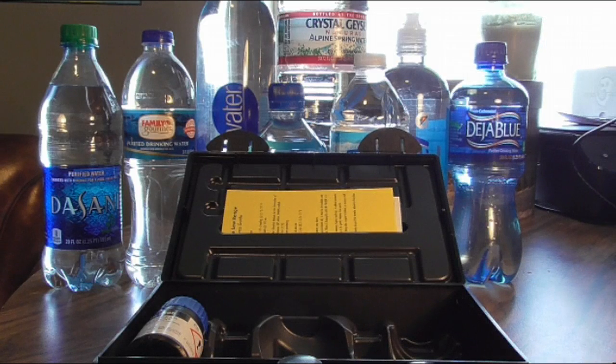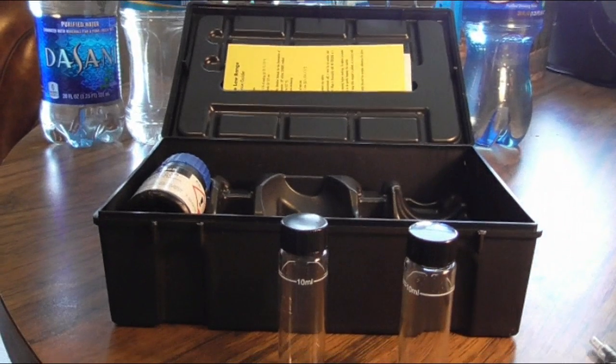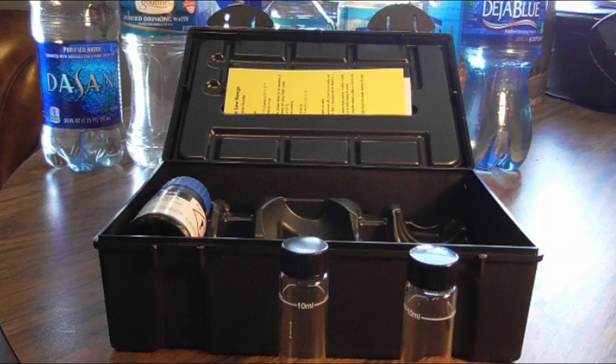The steps are the same thing: you put your first vial in, it does a countdown for two minutes reading it, then you pop in the next one and it gives you what should be around a 0.92 to 0.97 reading somewhere in that ballpark. That's average. That's showing you that it's working, and that's what this is for — to calibrate it right out of the gate.